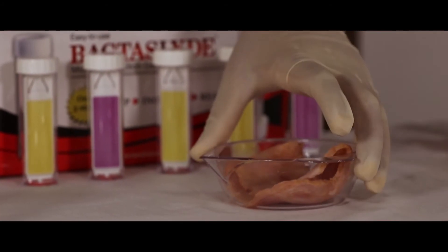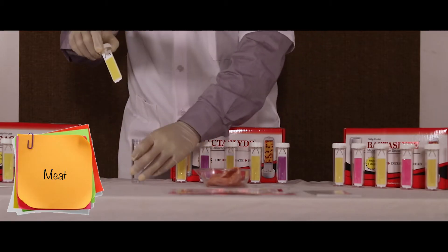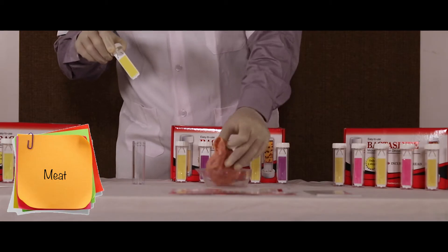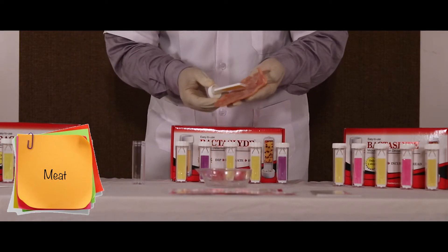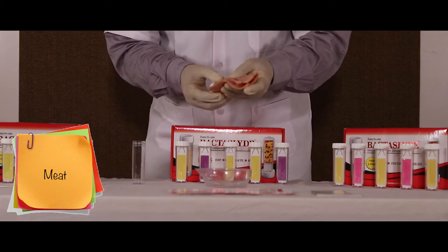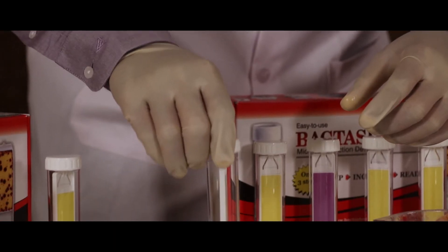For solid food, we are using chicken as a sample. Unscrew the slide and sandwich it between the food item for at least 30 seconds. After the desired time, screw the slide back in the tube.